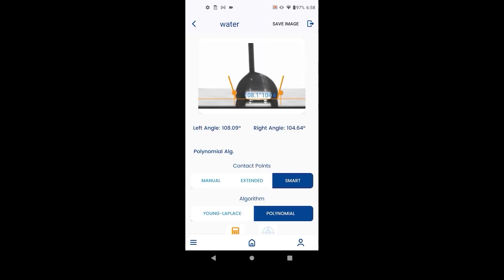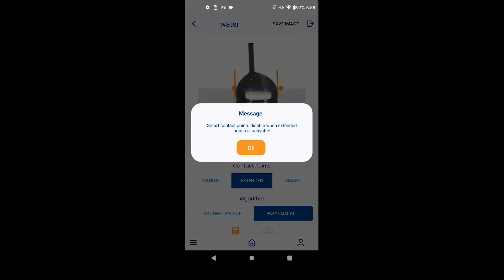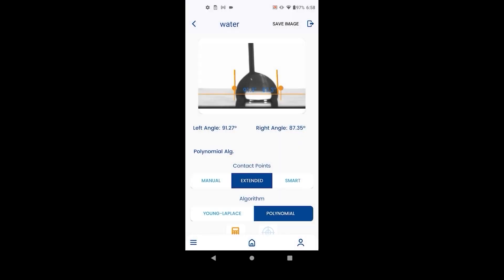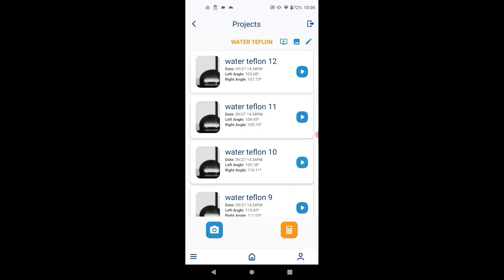In case smart contact points does not work, there are two alternate methods that the user can use. Manual method forces the measurement where the user decides. Extended method is an alternative algorithm which uses more of the droplet profile to find the contact angle.